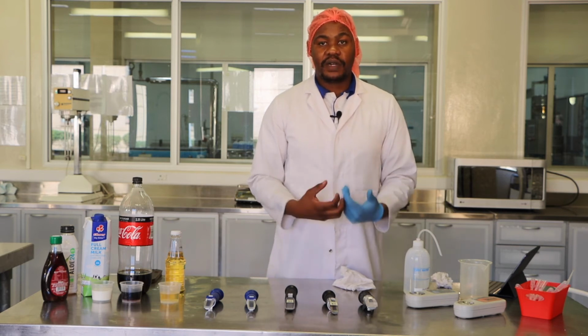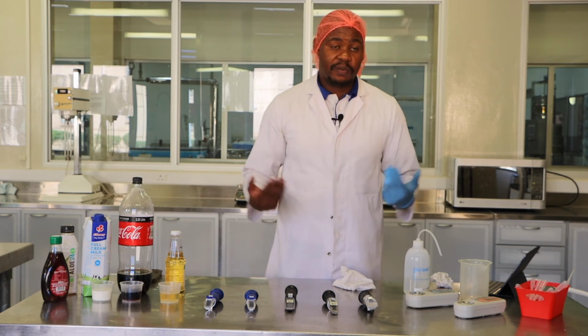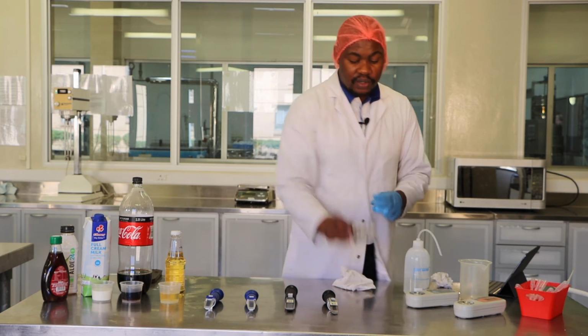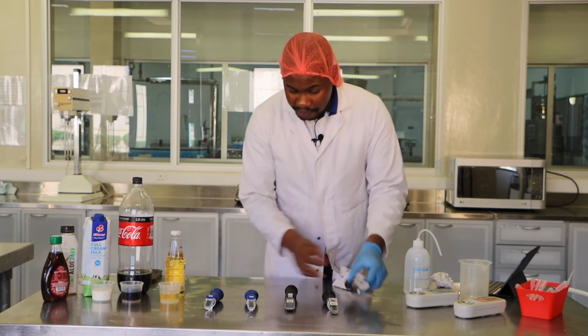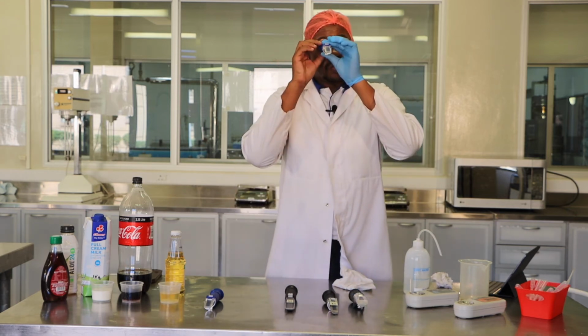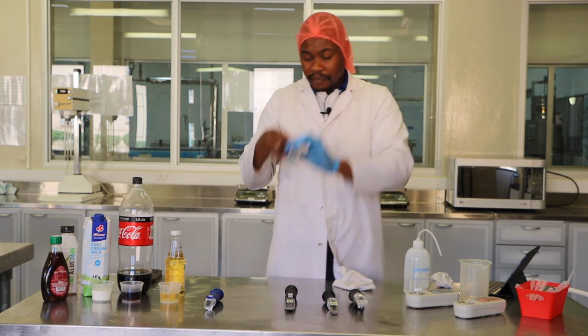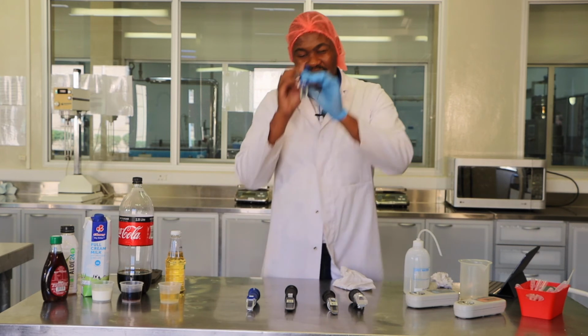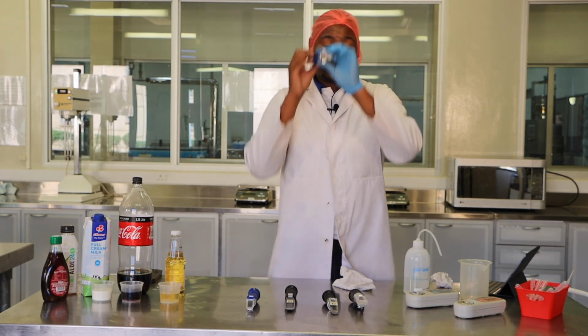So we can look for a refractometer with a scale which is below 20% or even 30%. The refractometer that I have here is 0 to 50, and here it's 0 to 60. This is 30 to 60, and this one is 0 to 30. So I can also use this 0 to 30 refractometer.